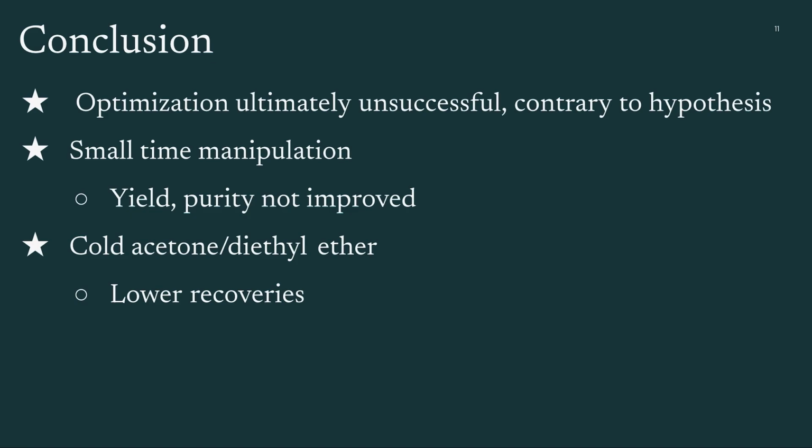Because the increase in time was small, we still cannot rule out improvements. At a 6-hour or 12-hour reaction time, those may improve, but those were outside of our experiment's constraints. Overall, the experiment shows that the solvent choice during recovery has a large impact, and that more significant time adjustments would be required to meaningfully compare that to the literature and our original week 0 synthesis.